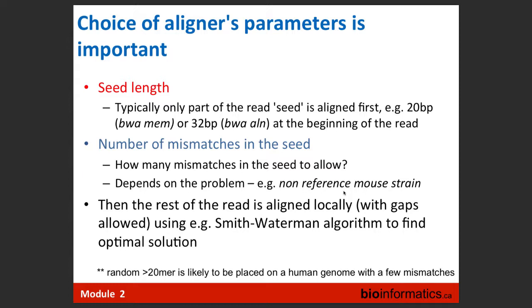The second is, you remember this plot you saw in the FASTQ, right? That quality winds down, so the error rate grows with the length of the read. So presumably, at the tail of the read, we will have a higher error rate. Yes? So, I know shorter reads are cheaper to sequence. Why?